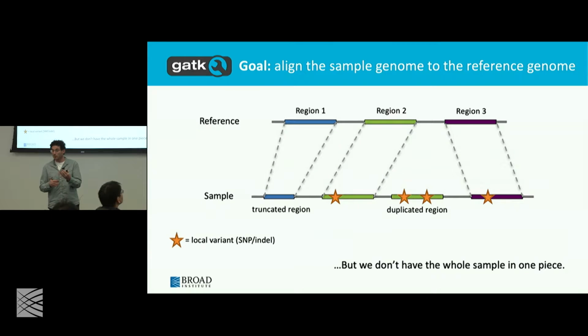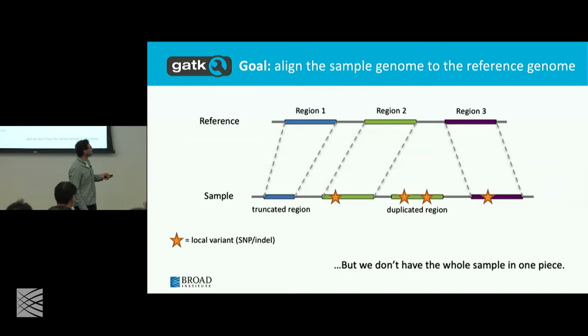So those artifacts will be visible in your file. You will see that at some point there's a whole list of reads that are clipped. And so that's an indication that there's a problem. But it could also be an indication that there's some bacterial contamination. So it's not so simple.